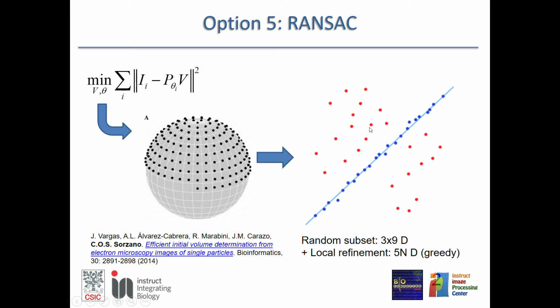So you assign randomly the angles to all projections, but some of the random angular assignments will be consistent with each other just because of chance. Especially that is true if you use relatively few projections. If you reconstruct using those images that are more or less consistent with each other, the rest will not be consistent because they were randomly assigned.